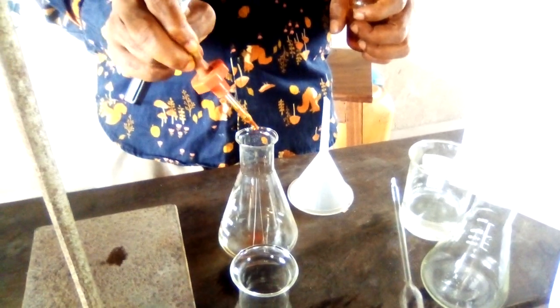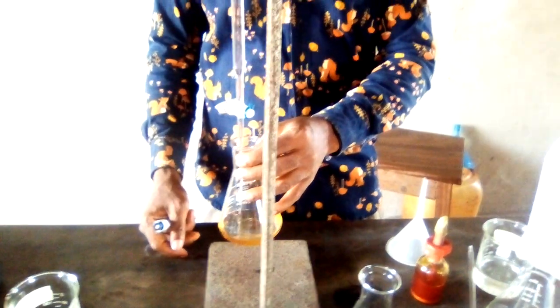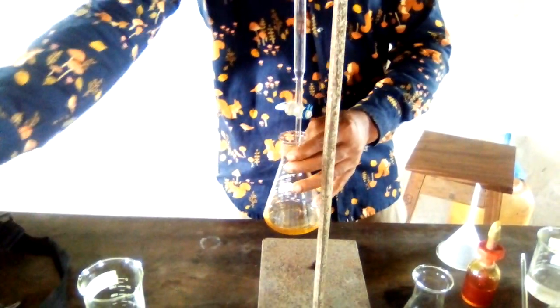Having done that, go back to the burette and start our experiment. This is the base already prepared, that is F, prepared into the conical flask. All we have to do is add 2 drops of indicator, methyl orange. Two drops into the base, then we swirl the flask, and we have a yellow color. We now start titrating. Somebody should get me a filter paper, a white paper here. Do you have filter paper or wiper there? Just give me one. All right, this wiper serves as our white tile. So we titrate while watching for the color change.